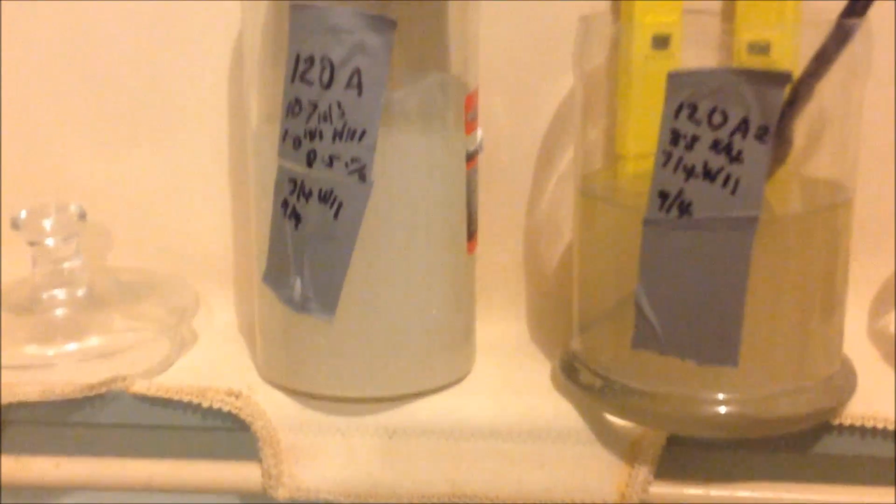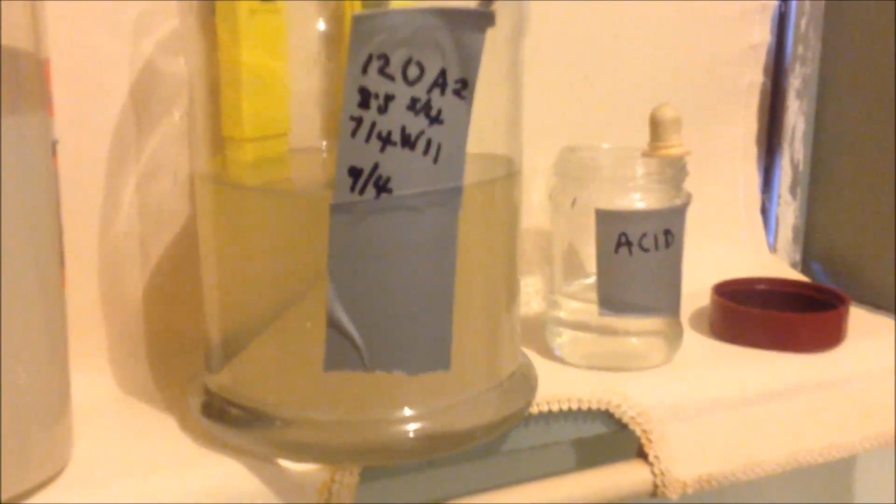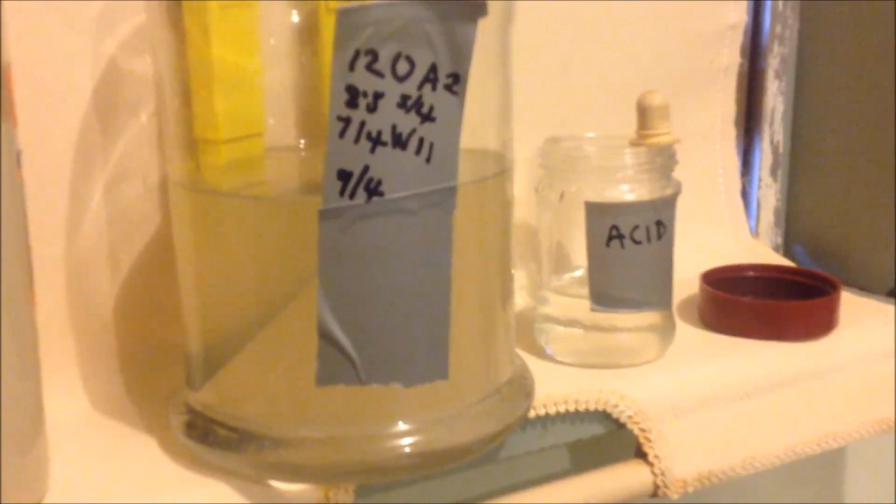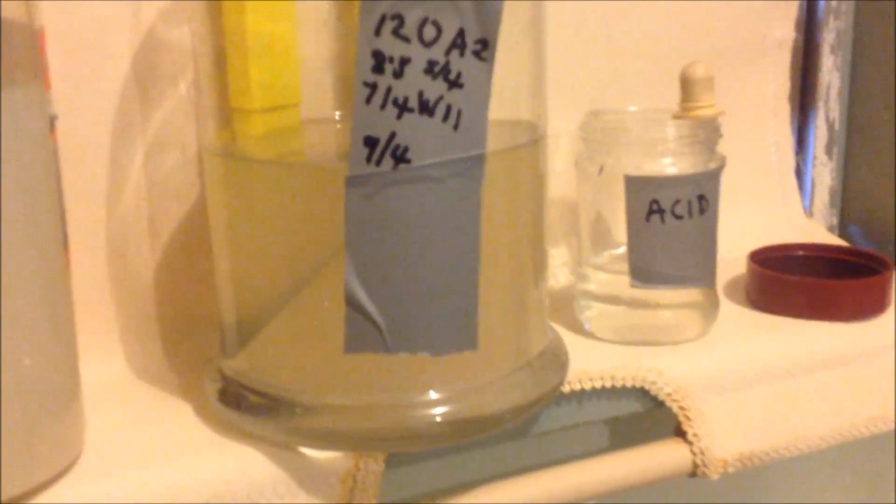Both solutions have been brought down to pH 1, and you can see the one that had the lump dissolved in it, or I should say I mashed it up. Then today, 7th of 4th, it is clearing at pH 1. You can see the spatula through the solution, and most of the lumps I crushed up have been dissolved, so that's going well. This one here, I actually brought down first, and it's still struggling to clear. Still looks quite milky, the suspension there.